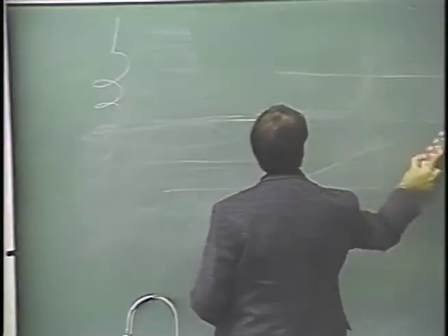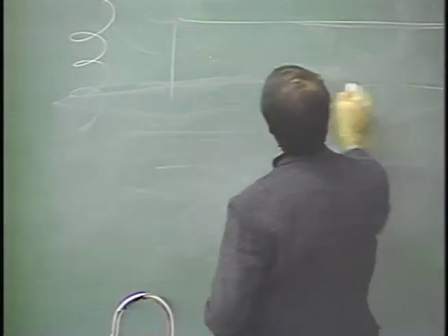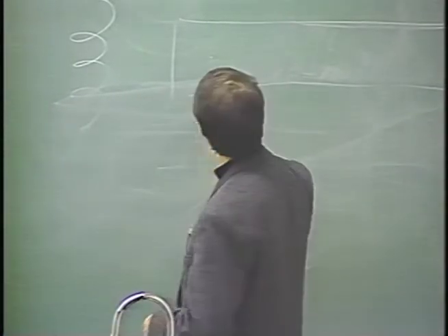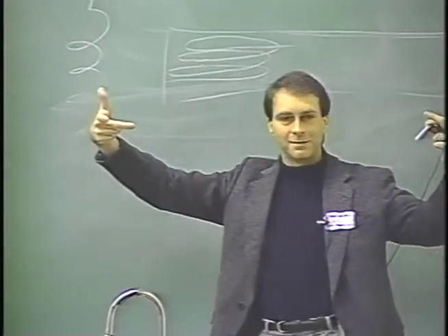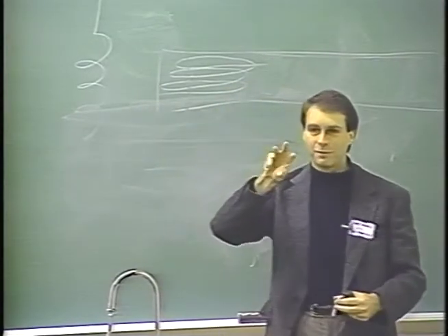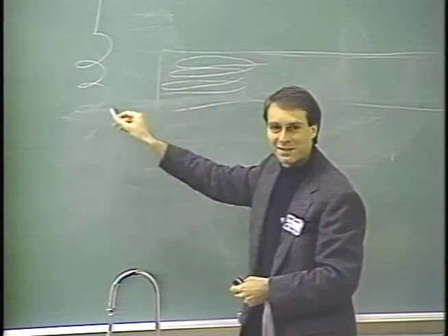Our current model, our ideas of what's going on, which comes as a result of both Michael Braunfeld's and Karen Hahn's modeling, is that if one looks down, if here's a chunk of the 1,300 angstrom fiber, which would be going off to infinity in either direction, the idea is that there are loops like this, which are then super twisted like this in the chromosome. And so when we cut it at an arbitrary point and look end on, what you see is the equivalent of many strands doing this. Okay? And what we're just finding now, and starting to be able to trace, is these loop-around points that tell us that it's coming back.